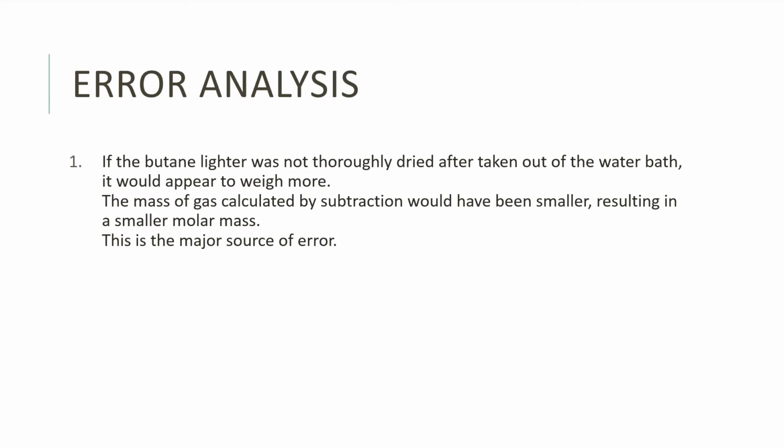Error analysis. Some possible points of error include: 1. If the butane lighter was not thoroughly dried after being taken out of the water bath, it would make it appear to weigh more.